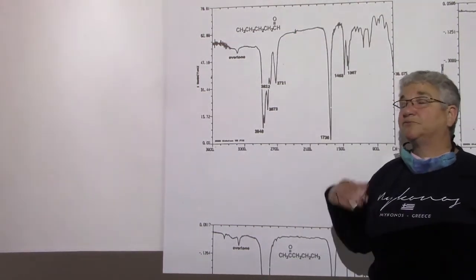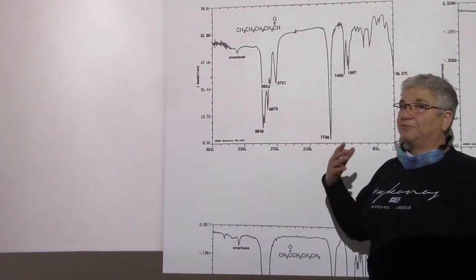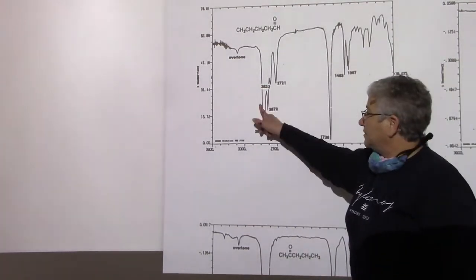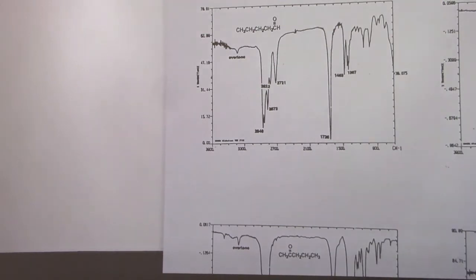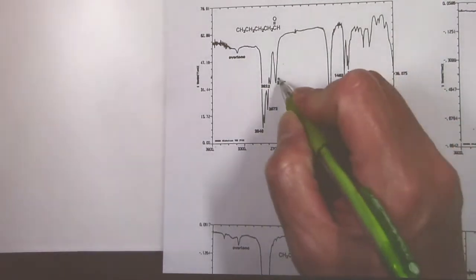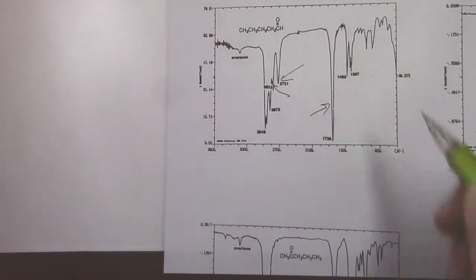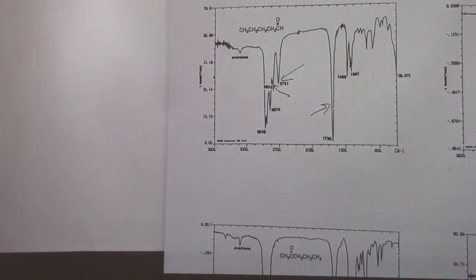And again, this just reinforces what are the structures of our functional groups. Okay, so then we have CH stretches and fingerprint, and that's it. So remember, you need that little peak there, and you need that peak to be an aldehyde.